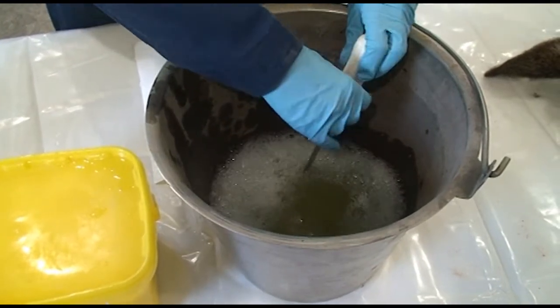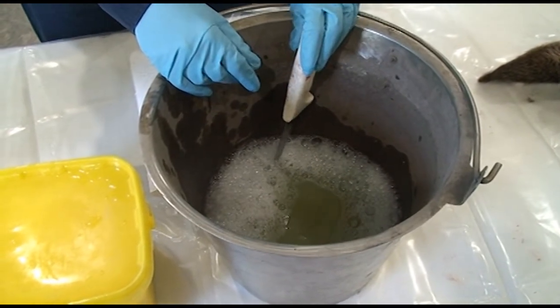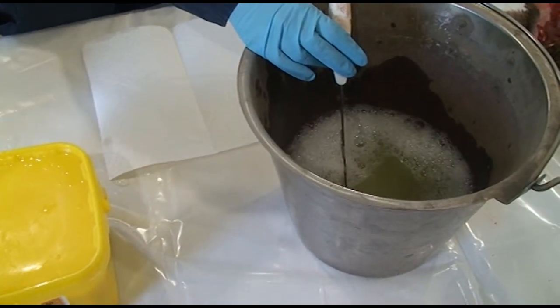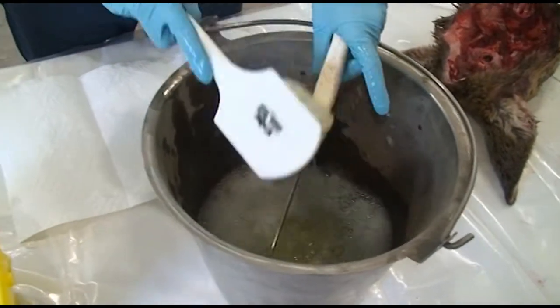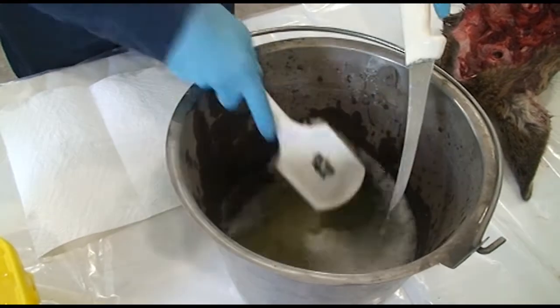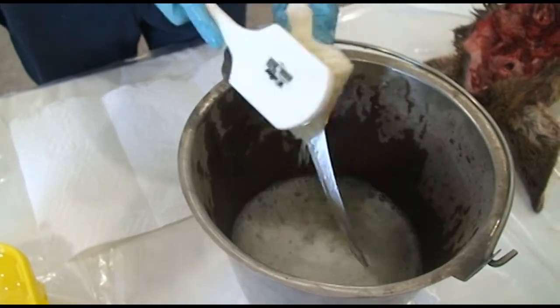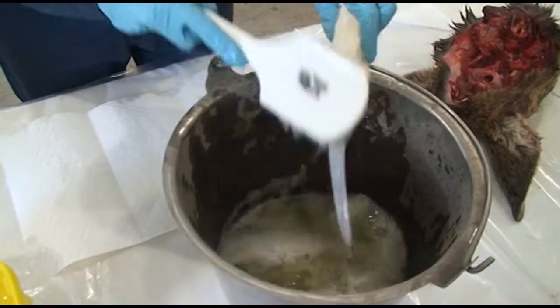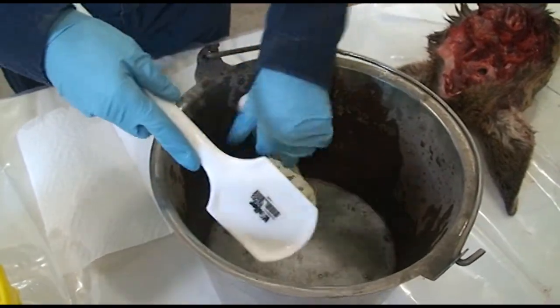And so we're getting a brush here to clean up our equipment. And once we have that done, we'll dry it good and lay it out. And then also on the table surfaces and anywhere that you may have contaminated when you're doing your sampling, you can also use this water and this brush to clean that. Sometimes the floor, definitely the table surfaces if they weren't covered that you've been working on. And then the coveralls that you've had on for sampling, you want to wash those before using them again. Just hot water and laundry detergent works fine for that.